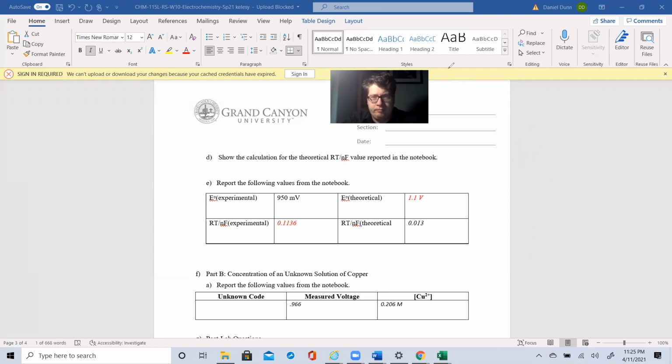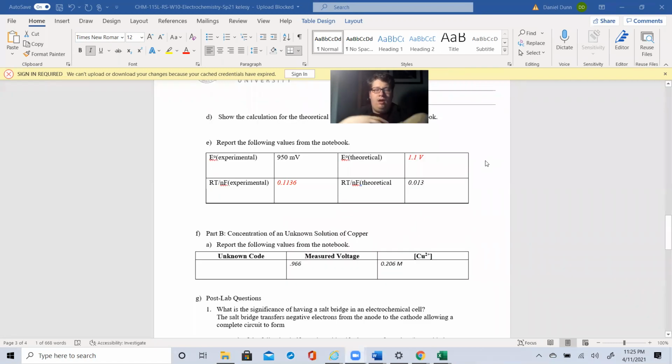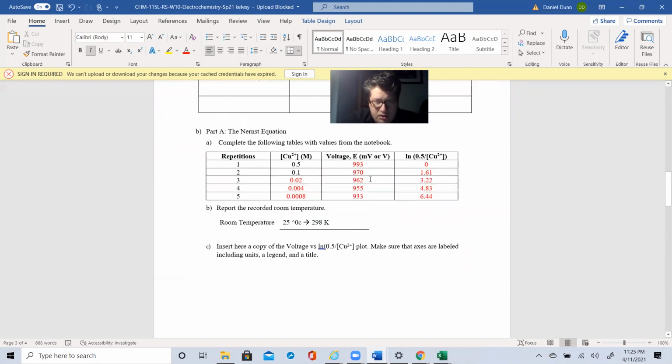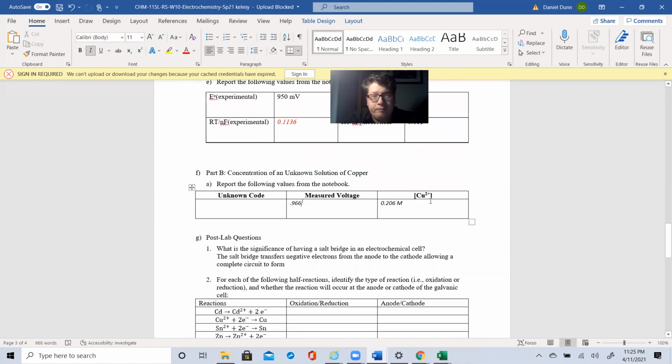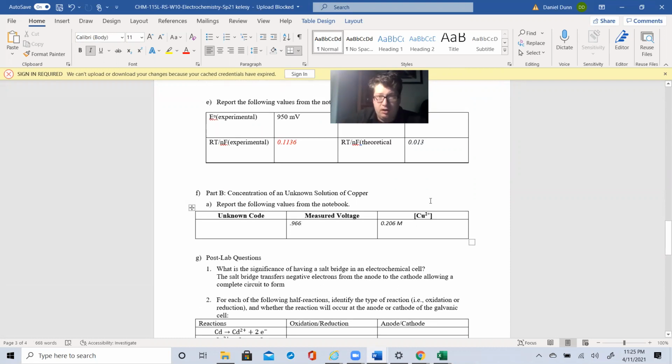Goes in there. Okay. Next is the unknown. The unknown is going to be a calculation based off the charge. Whichever one it is closest to, the student said it was close around here, so we assume that one. Plug that in there. Simple as that. Or if you wanted to, you can assume, save yourself a lot of work, but if you want to be very accurate, you can solve it using the Nernst equation.